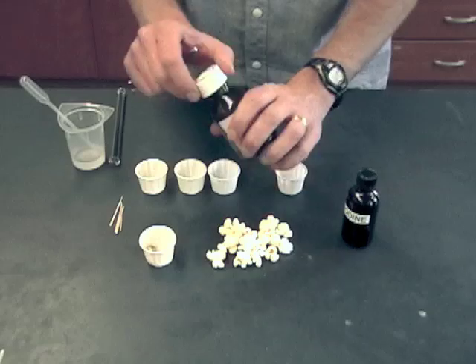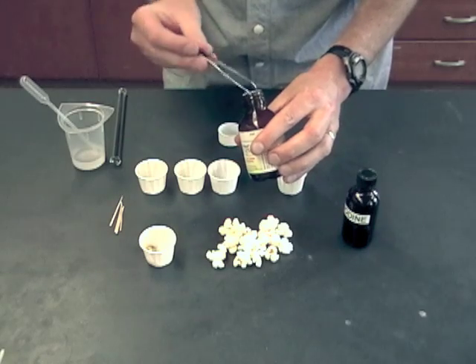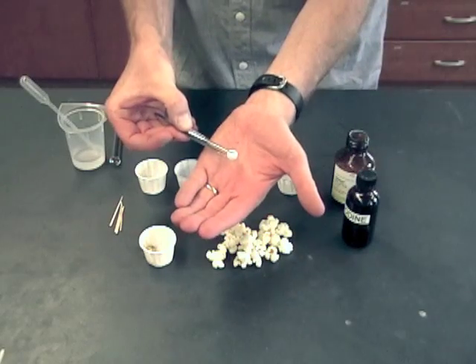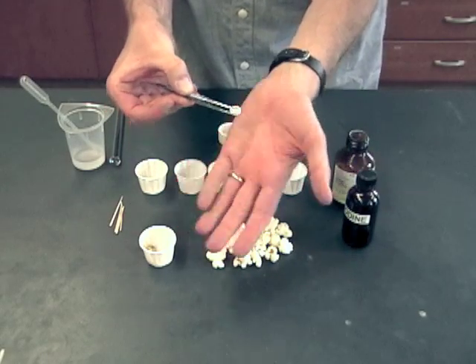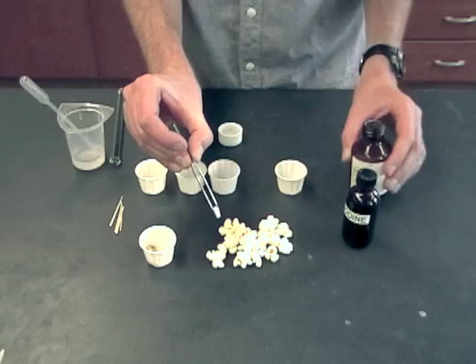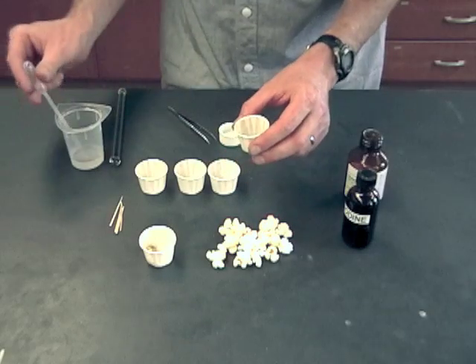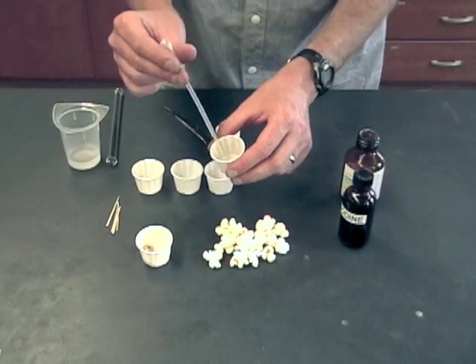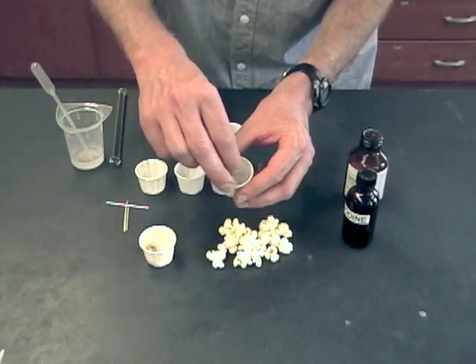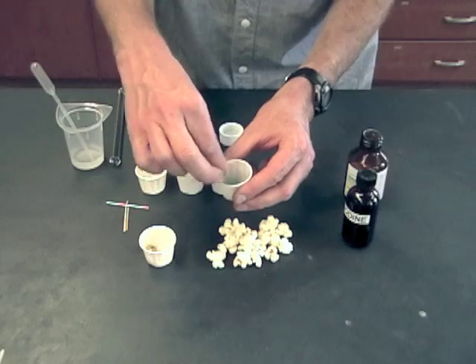One thing important about the ClinTest tablets is that they contain sodium hydroxide. That actually helps them dissolve better, but it also means that if you sat there and held one in your hand for a long time, it would start to melt and you might get a little burn on your hand. So we encourage people to handle them using the forceps here. And when you're ready to use one of them, you can put them in your cup. They need to have a little bit of liquid with them. That could be water or saliva or anything else. And you'll see that they start to fizz up, and it's actually kind of helpful to use one of these little toothpicks to mix it up and make sure that it gets completely dissolved.